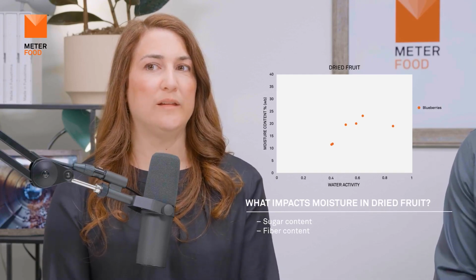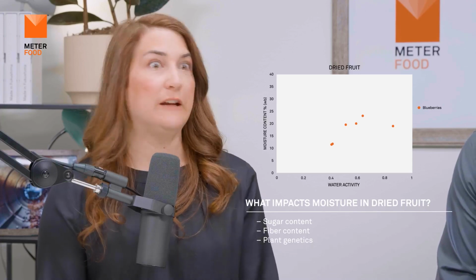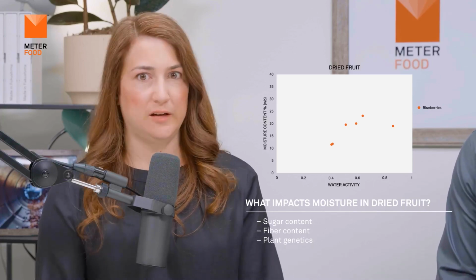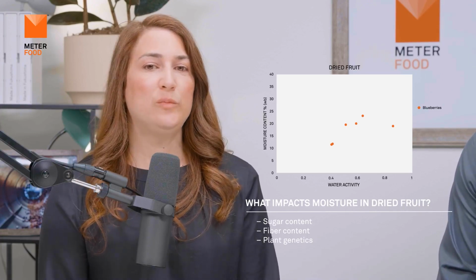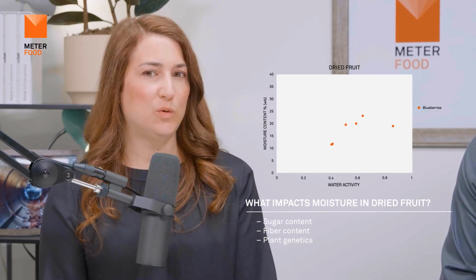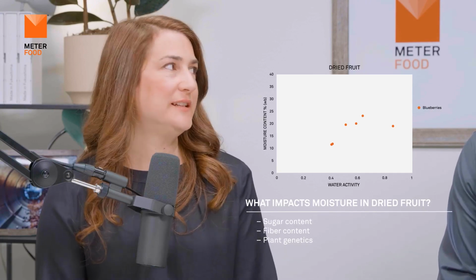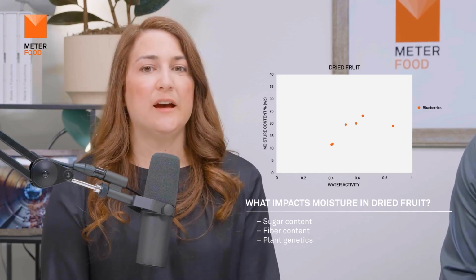It could be within the different kinds of fruit. Another example is mangoes, which are very fibrous fruit, and you get a really different relationship there. We've got a lot of variability within water activity and moisture content for that. Blueberries have more of a trend, so that's where we wanted to show that there is a more predictable relationship between water activity and moisture content. But even at that, you're going to get differences in the sugar and fiber content even in a blueberry.